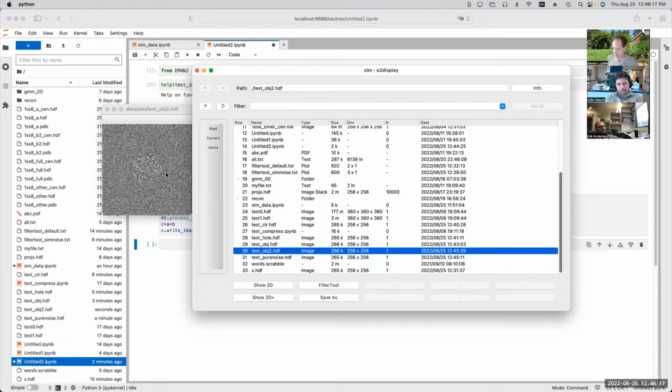But from another perspective, a lot of the noise is just shot noise, which is coming from the actual imaging process. And that shot noise is going to be present in every pixel location, not depending on where the protein is or isn't. So there's a certain component of the noise which comes from the solvent itself, and then there's another component which comes from the shot noise and other noise sources, detector noise and that sort of thing.